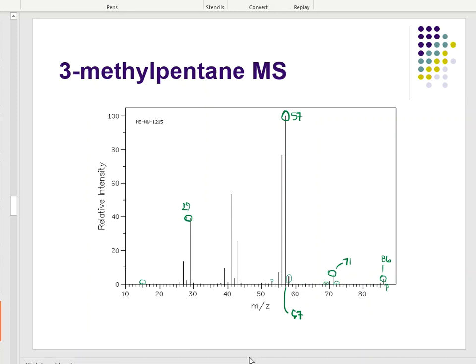Those are due to some isotopes that we're seeing. So we really can't go by those small ones. But out of some of the major ones, we really have identified quite a few of these. Well, we've not identified that one. And in the previous ones, we've not identified every one of those either, right? We kept saying there's some there that we're not going to worry about yet. We'll eventually get there, but just not yet. I don't want you to focus on those.